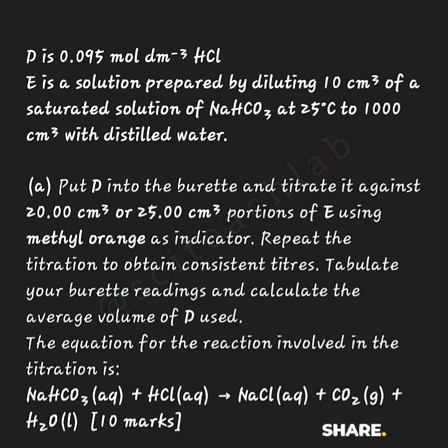Remember, the equation for the reaction is NaHCO3, sodium bicarbonate, plus HCl (aq), that's in solution, hydrochloric acid, yields sodium chloride (aq) plus carbon dioxide gas plus water (l). So there is carbon dioxide gas evolved. So normally, if you do all this correctly, your 10 marks is already set.